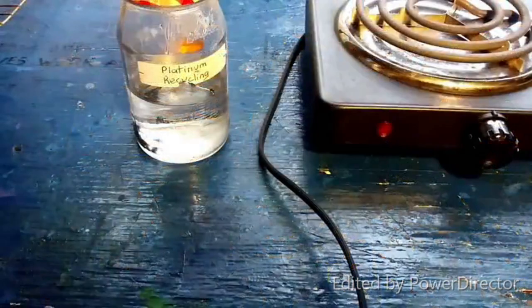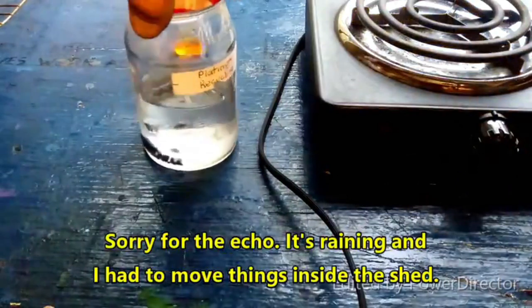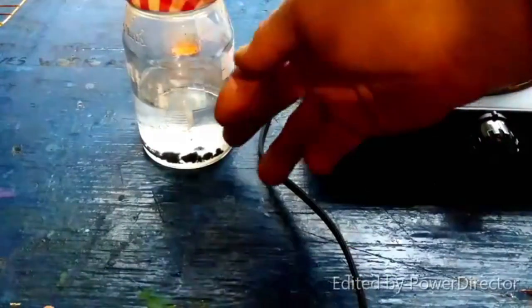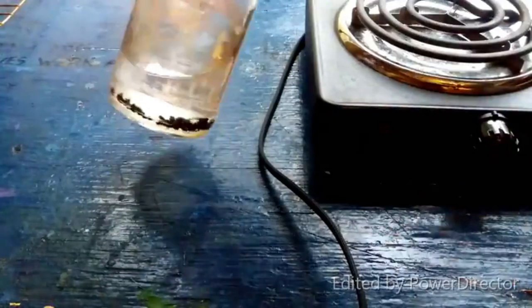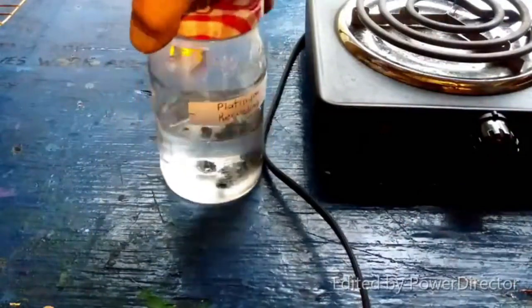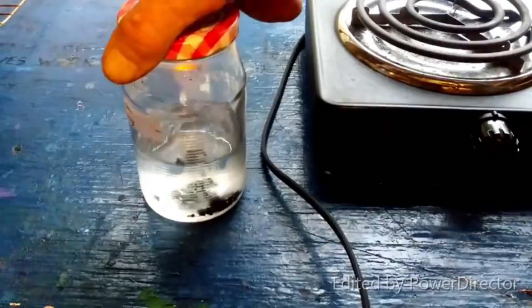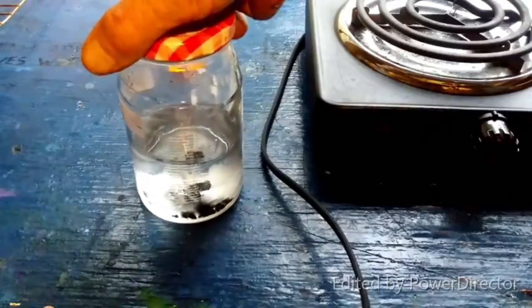So it's the next day, and you can see here that all of the platinum in the platinum recycling reduced last night down to powdered metallic platinum. Like I said yesterday, it does have a tendency to clump up, but I don't know that should be too difficult to deal with. I mean, once it's dried out, I imagine it would probably be very easy to separate the particles.